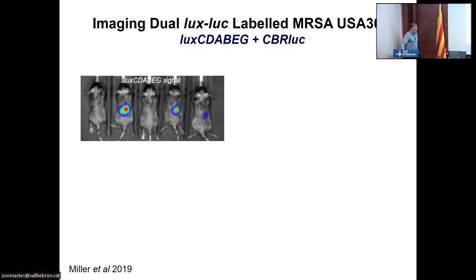So what we've done over the years is we've used different methodologies for targeting the bacteria, and most of it's been using the Lux Operon. When I first joined what was Xenogen then, back in 1998-99, I designed an operon that had LuxABCDE, but one of the issues with this in gram-positives was that it had polar effect. So I redesigned the operon, and we found the bacteria were much brighter. But what I also did is link the operon so that it had a click beetle luciferase too.